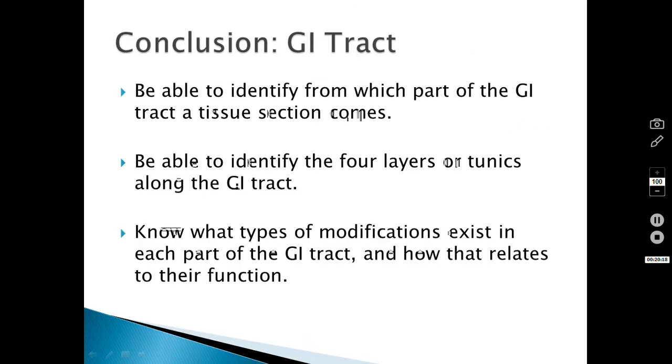So in terms of what I want you guys to be able to do, you need to be able to look at a tissue and tell me what part of the GI tract it comes from. Is this from the esophagus? Is this from the small intestine? Is this from the large intestine? Is this the jejunum? Is it the ileum? Whatever the case may be. So you should be able to do that.